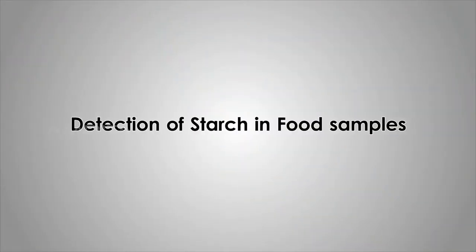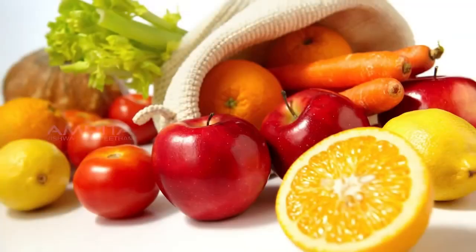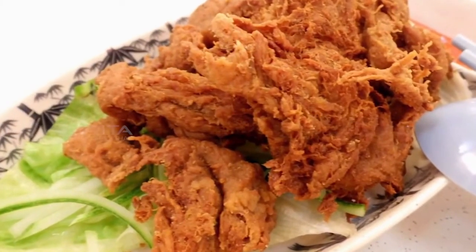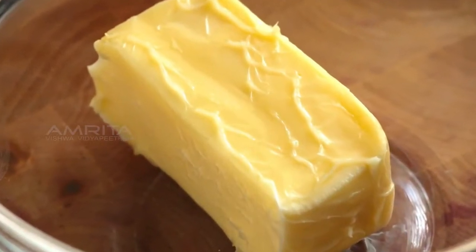Detection of starch in food samples. Food is the main source of chemical energy for all living beings. Food contains the essential nutrients for living things such as carbohydrates, fats and proteins.